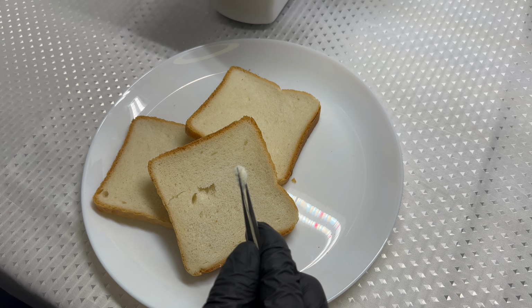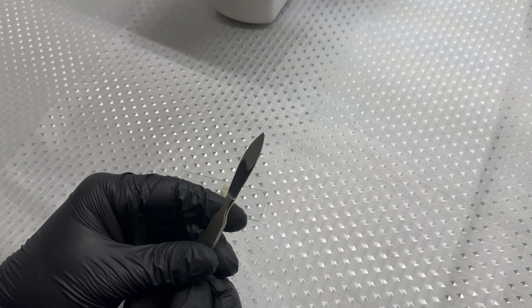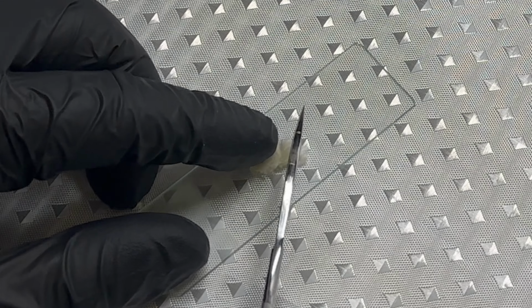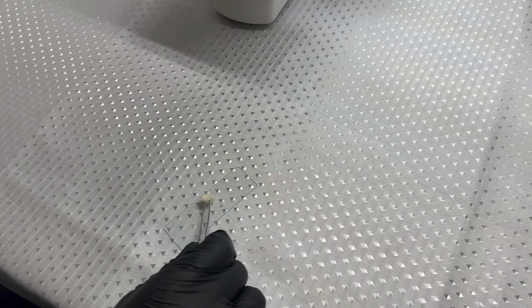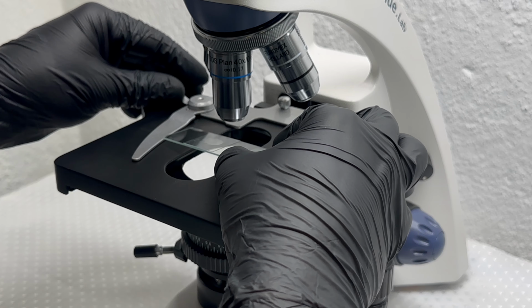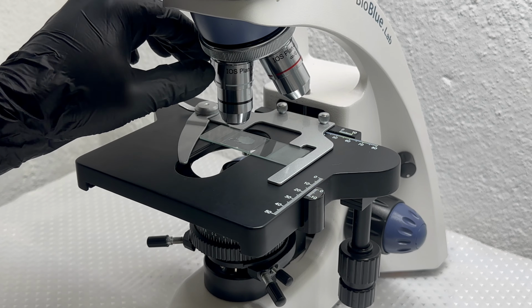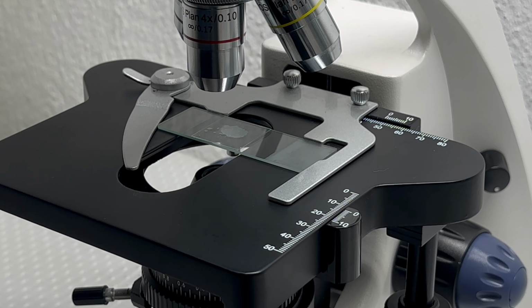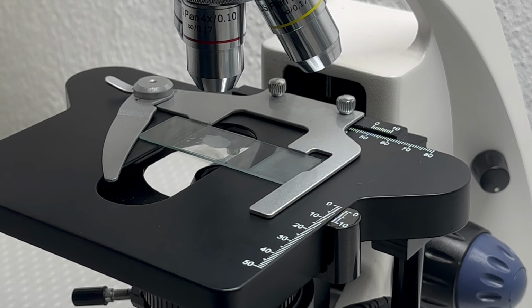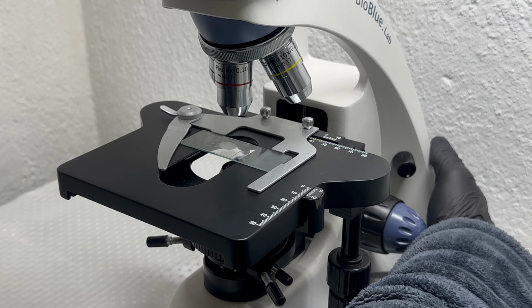I begin by showing the bread as we normally see it before preparing a very small sample and examining it under a microscope. The sample is tiny, almost invisible to the naked eye, yet it holds the entire internal structure of the bread. Once placed on a microscope slide, this small fragment becomes a gateway to a hidden world that exists inside something completely familiar. What feels simple on the surface often reveals unexpected complexity when viewed up close.